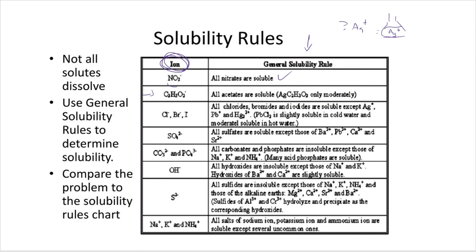Look at this. I can add a chloride to this solution, like salt, NaCl. So I'll add chloride to this solution, and chloride's going to come in, and that silver is going to look at that chloride, and it's going to go, hubba, hubba. That's what I want to be with for the rest of my life.